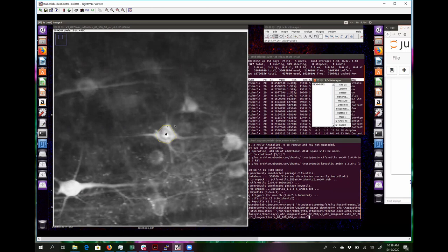Then what you're going to see is that this whole field of view is going to shift slightly to the left, slightly to the right, up or down, like one way, right? So there's some movement of that field of view relative to these pixels. These pixels, remember, are sort of fixed to your size.